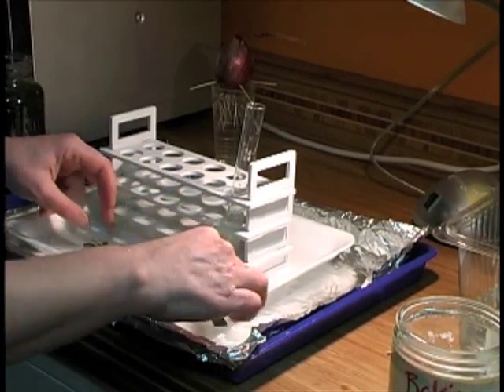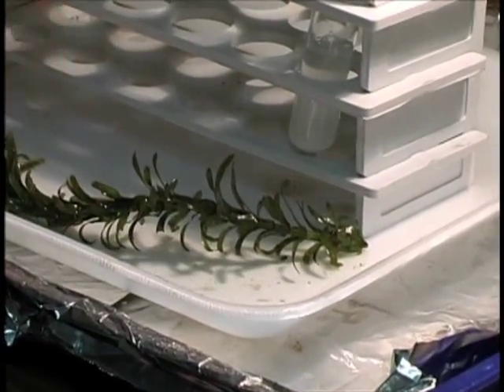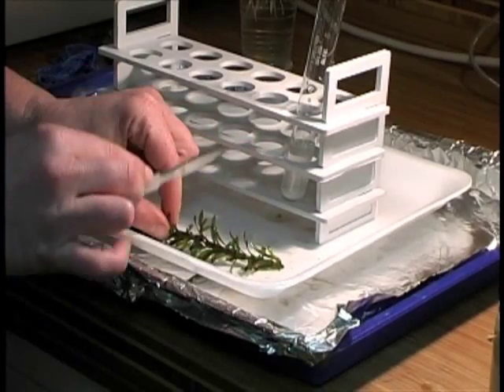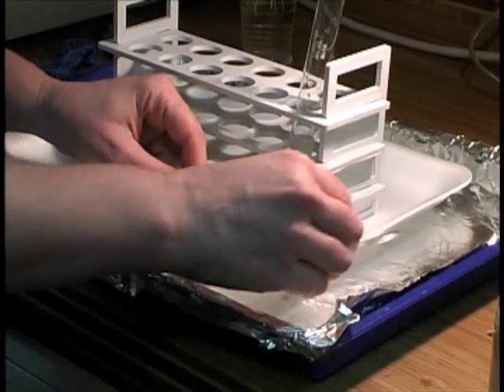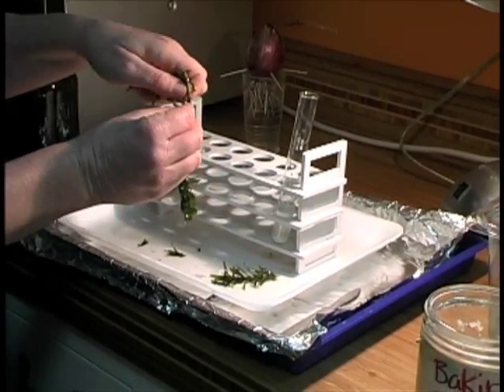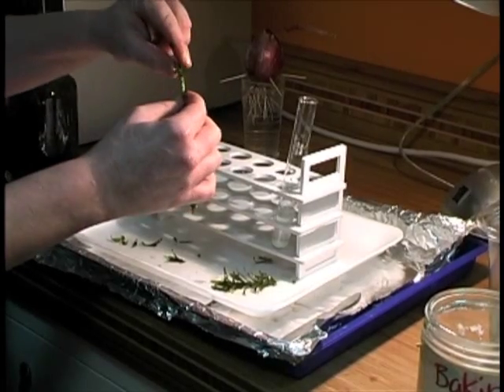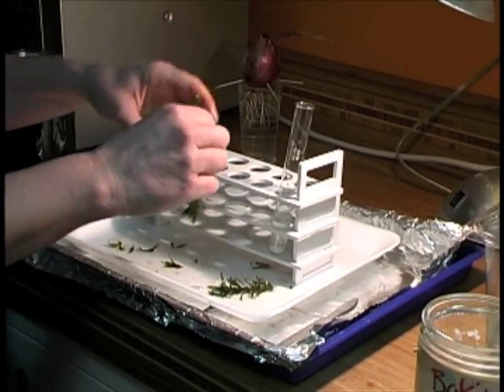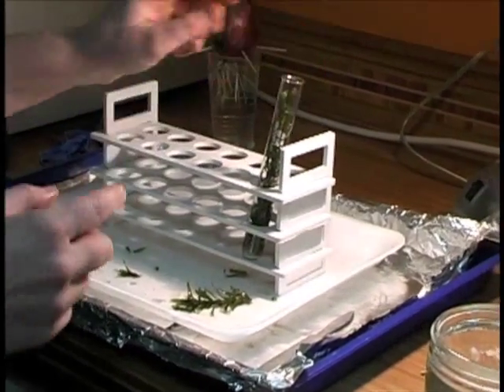Now I'm going to cut my Elodea. I want to make sure I cut it so that it's shorter than the test tube, and I want to angle the cut — not 90 degrees, but about 45 degrees. I'm going to cut off part of the stock using my scalpel, then remove some of the leaves so it's easier to see where I crushed the stem. Just pull off the leaves with your fingers. Then smash the end of the stem with your fingers for about one centimeter. Then you can put it in your test tube upside down with the stem on top, and continue filling it with water.